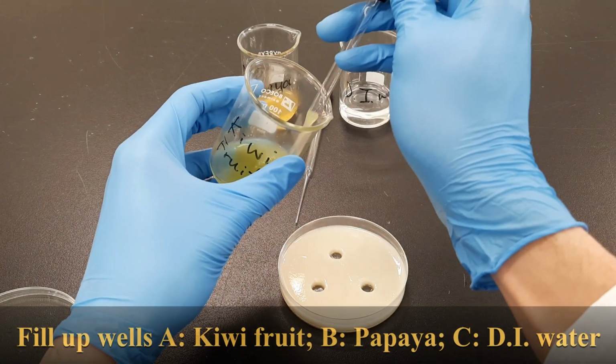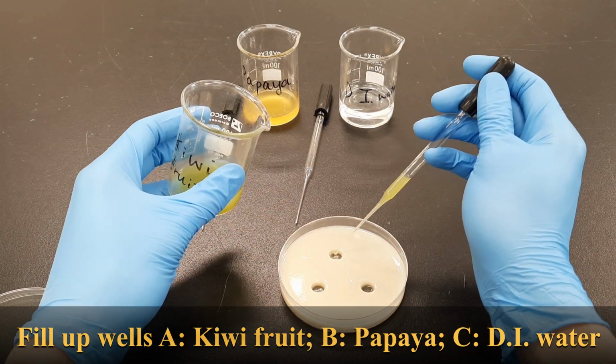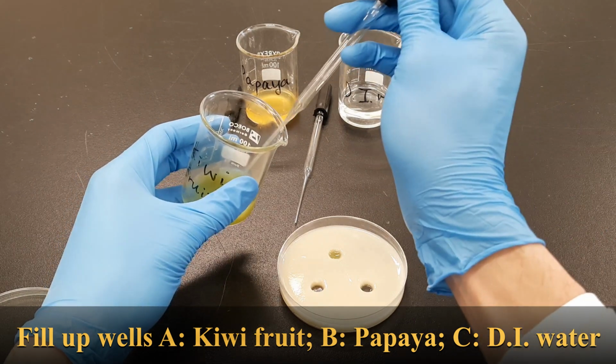Use the dropper to fill up the wells A, B, C with kiwi fruit juice, papaya juice, and distilled water, respectively.